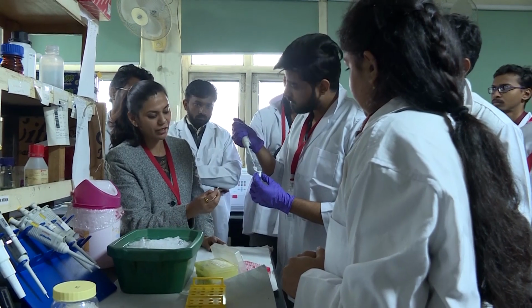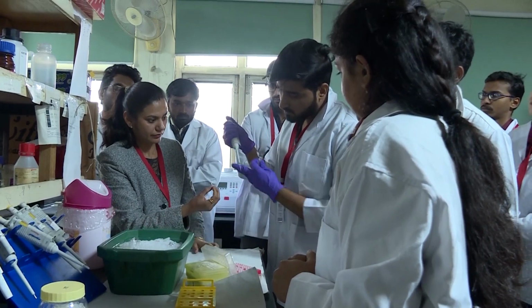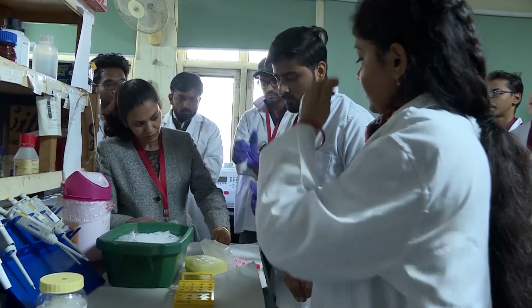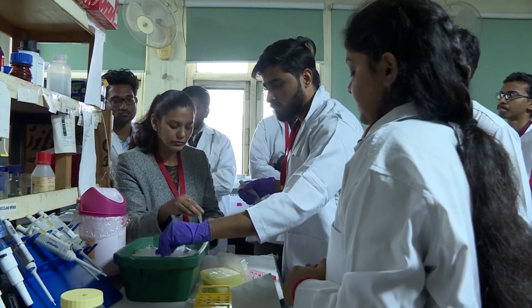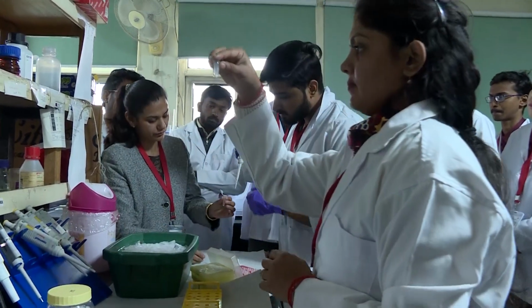Same primer, forward primer, actin. This one is the heat stress, this is control. Now reverse primer of actin. And same, this is the reverse primer, 0.8 microliter, same.